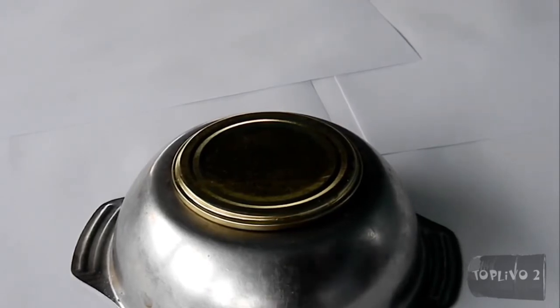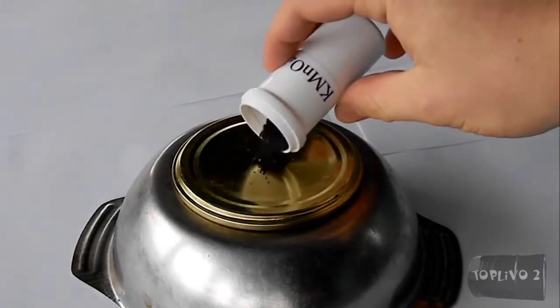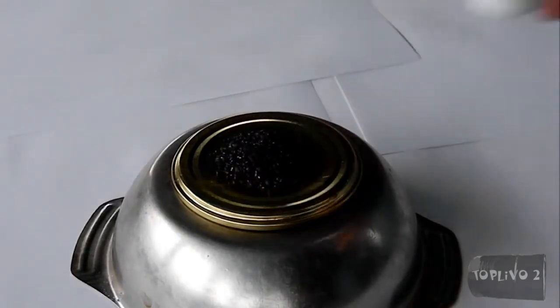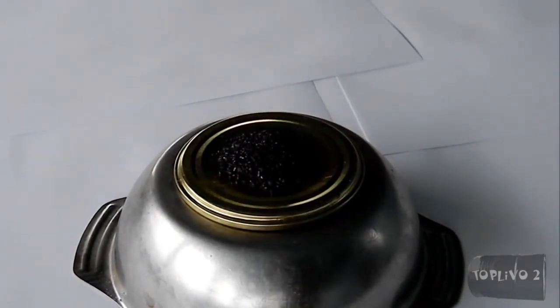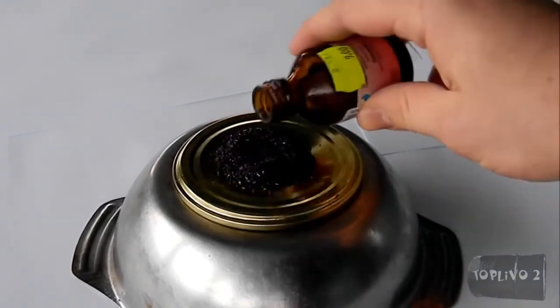The first reaction, which is already known to many people, is the reaction of potassium permanganate and glycerin. Let's pour the potassium permanganate, make a small indentation for the glycerol, and afterwards add glycerol.